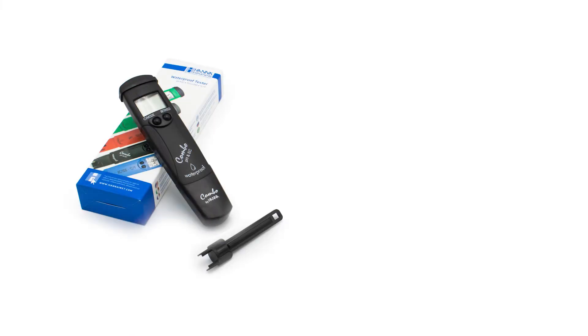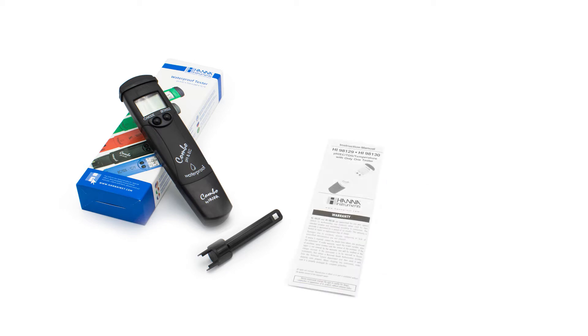Your tester comes with everything you need to begin testing. This includes a tool for electrode removal that helps you easily change your electrode if it ever needs to be replaced, an instruction manual, and quality certificate.